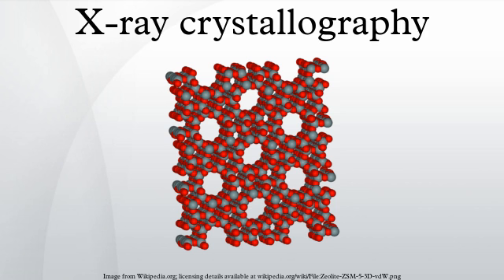Similar diffraction patterns can be produced by scattering electrons or neutrons, which are likewise interpreted as a Fourier transform. If single crystals of sufficient size cannot be obtained, various other X-ray methods can be applied to obtain less detailed information. Such methods include fiber diffraction, powder diffraction and small-angle X-ray scattering. If the material under investigation is only available in the form of nanocrystalline powders or suffers from poor crystallinity, the methods of electron crystallography can be applied for determining the atomic structure.